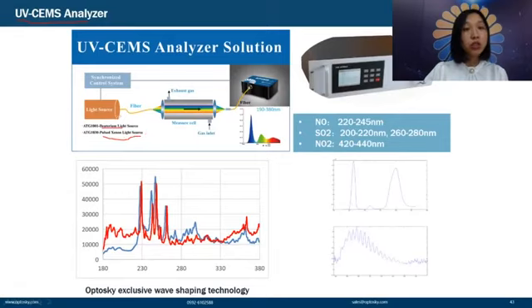for the light source. So the light source goes through the fiber to access to the spectrometers to make a measurement, and the smoke can shoot on from this port to here to make an analysis, and exhaust take the gas from this side so the spectrometers can make an analysis in here and export a spectrum.